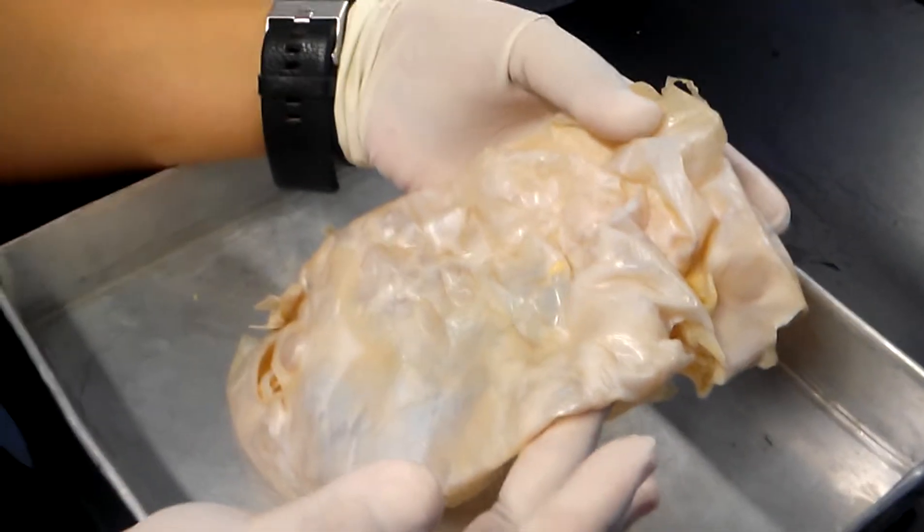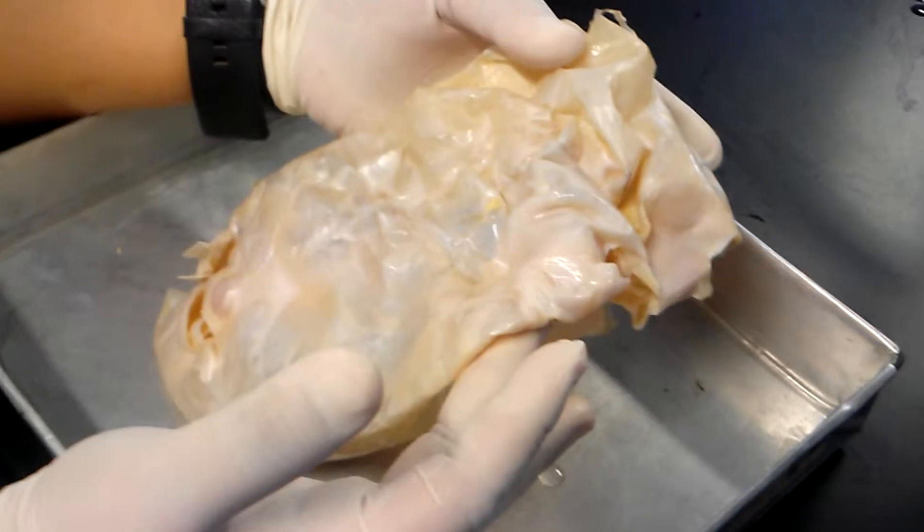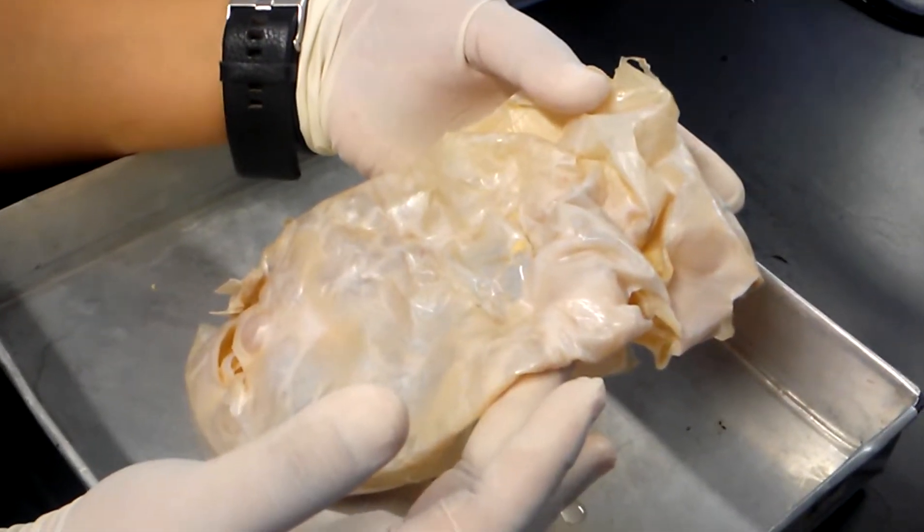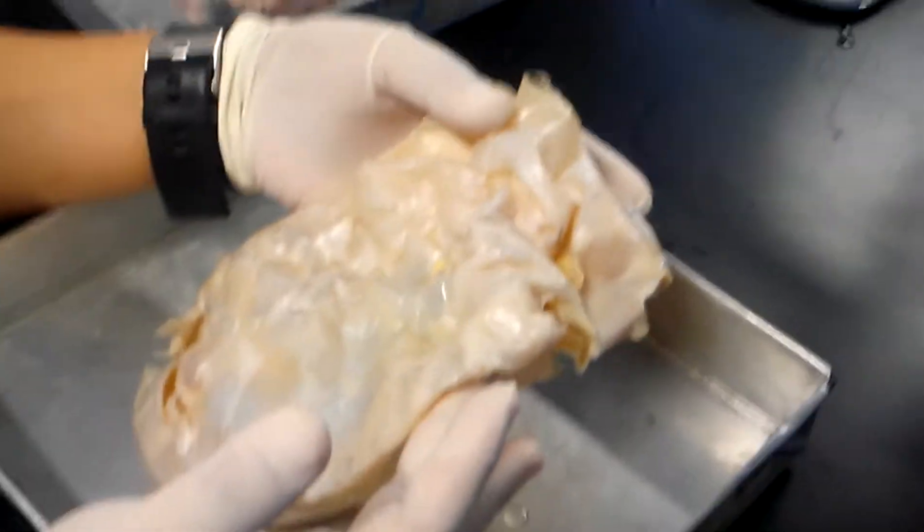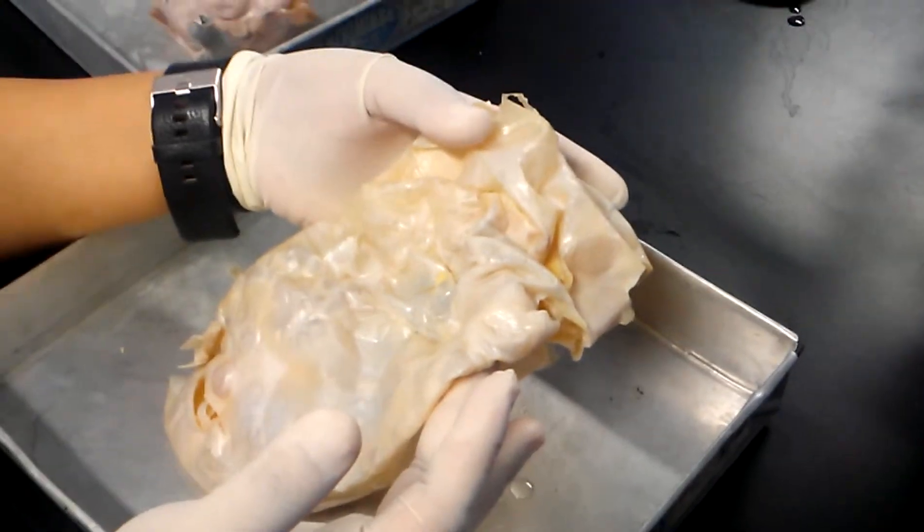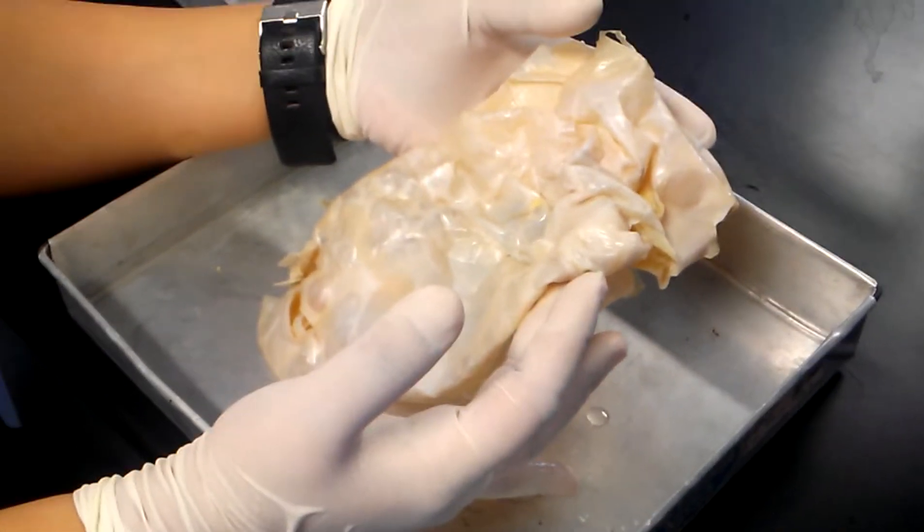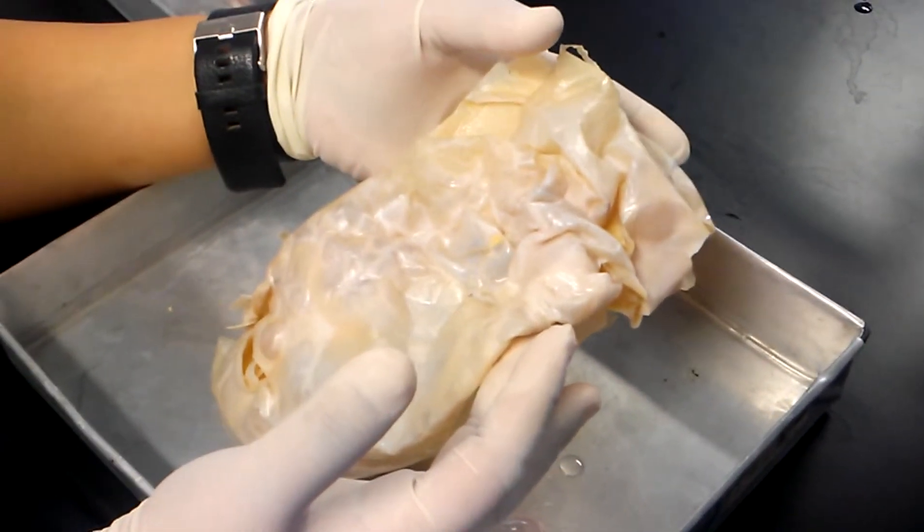If it's only one locule or one cystic space, we call it mucinous cyst. Two or more, or mucinous cyst. If there are two or more locules, you call it mucinous cystadenoma.